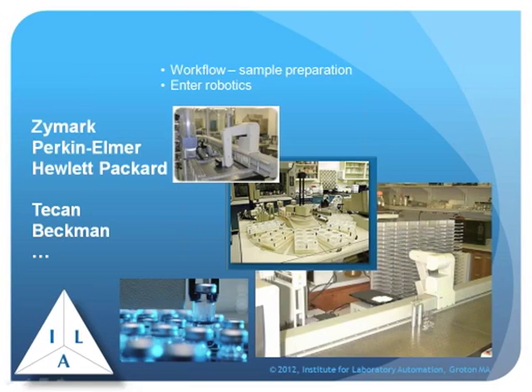Their idea was to have a centralized robot which had an arm that would go up and down and spin and rotate in 360 degrees and have all of the equipment that was being used by the analyst set up around the robot. The other format was to put the robot on the edge of the lab bench and have it run up and down the lab bench, have access to the full space on the lab bench, and work with any equipment that they needed access to.